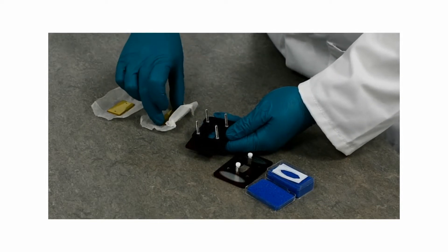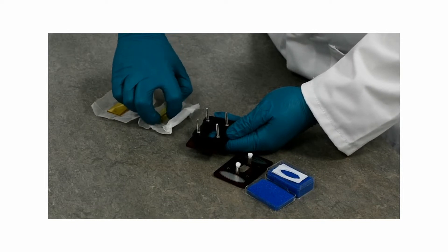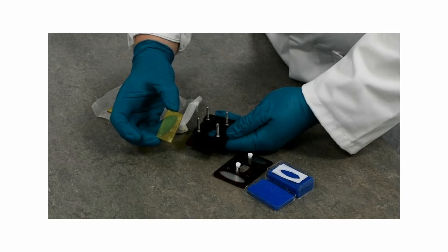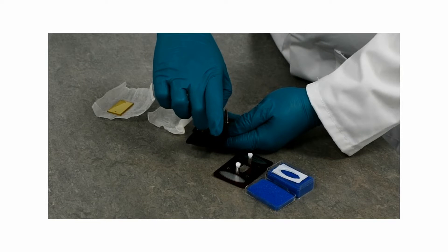You then take a window — here we're using ZnSe — and what you will find is that the back window is completely flat with no holes drilled in it. You mount that into the cell.